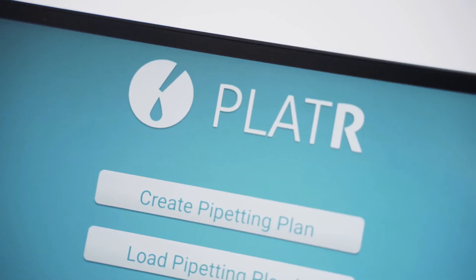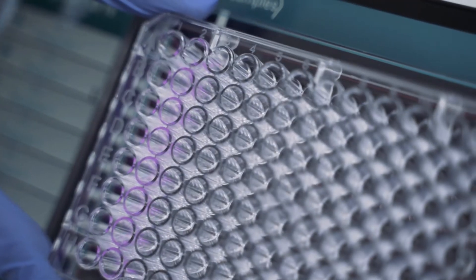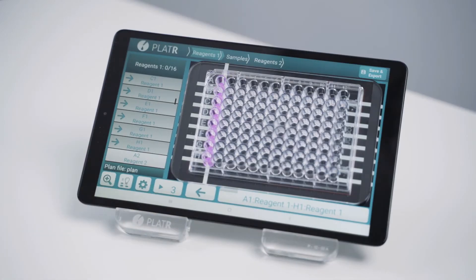That's why we created Plater. Hi, I'm Metka, Plater product manager at Biosystemica. Plater is a tablet application that illuminates the wells on your 96 or 384 well plates. With Plater, manual pipetting is much easier and the days of your pipetting mistakes are over.